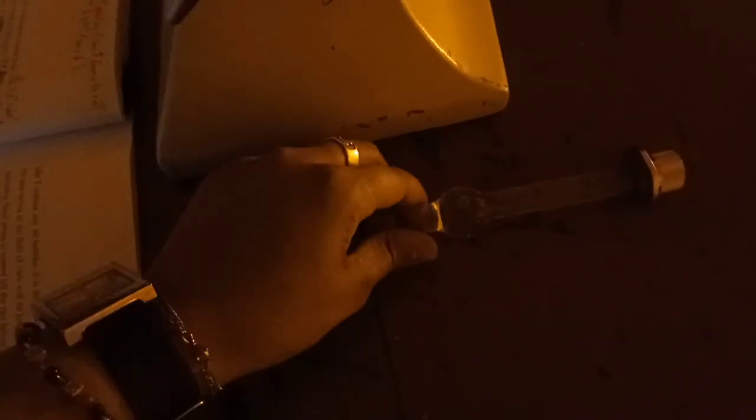Now, for the first part of the experiment, you will be filling this tube with distilled water up to the brim. The attendant will do that. You will have to make sure that an air bubble is not present anywhere in the tube, but rather comes to this central bulge so that it will not come in the path of the polarized light.